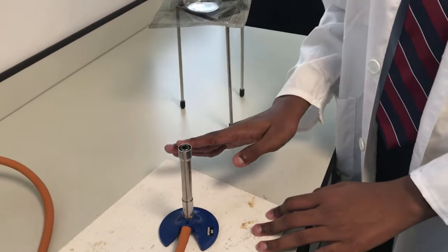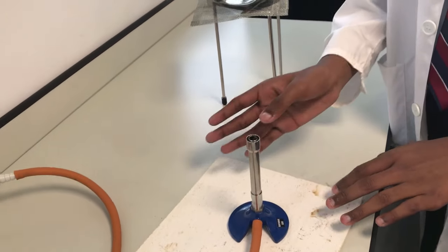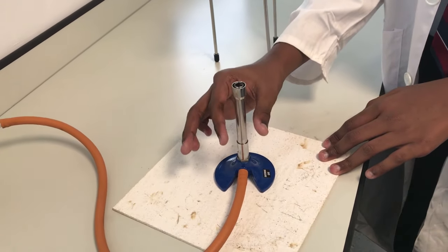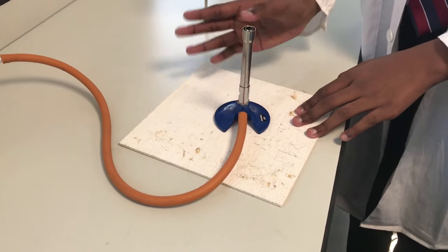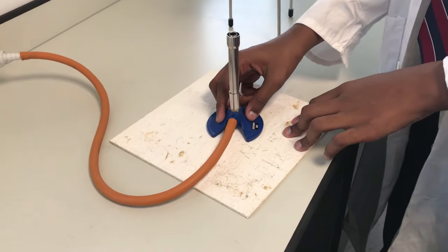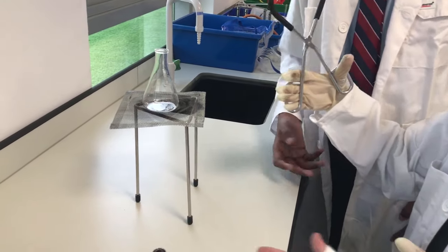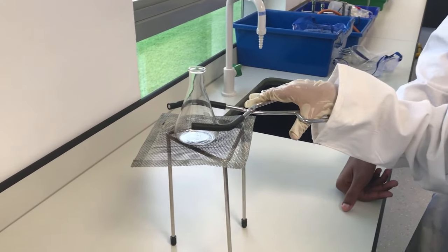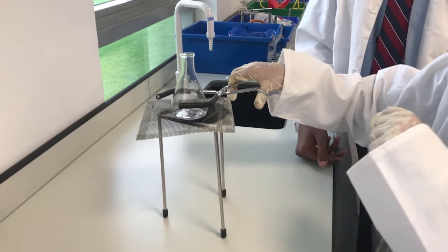So if the Bunsen burner is ever to fall, which shouldn't happen, then it will just put the fire out. But still make sure that you don't hold it on top here, either from the blue side or the collar, because the collar will only get warm, not extremely hot. Oh yeah, and one more thing, guys, never take a conical flask without tongs, uh, whatever.